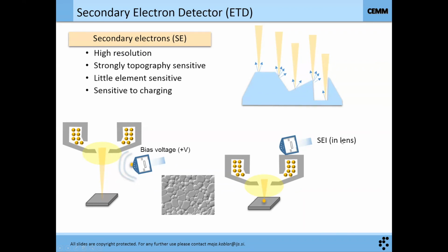When you have an in-lens detector, you actually need a magnetic field or electrostatic field to push the electron back in, so it goes inside the detector. In that case, you don't see such a nice image because you don't know where the detector is positioned, because of the Lorentz law, but you can get higher magnifications.